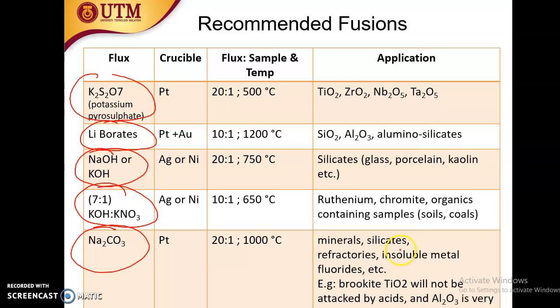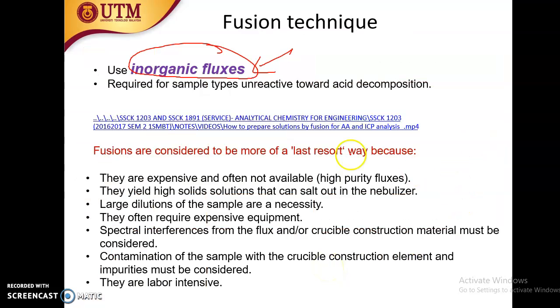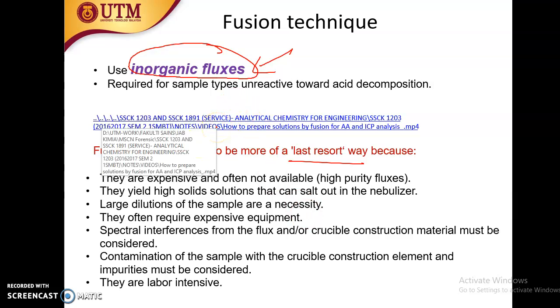If let's say dry ashing doesn't do the work for your silica, you can use fusion technique using disodium carbonate at 1000 degrees C to destroy silica. This is more towards a last resort, because flux is very expensive. It needs actually very sophisticated instrument. I'm not sure whether I have the video here. I'll try, but if I don't have the video, we can always go to YouTube and find flux.